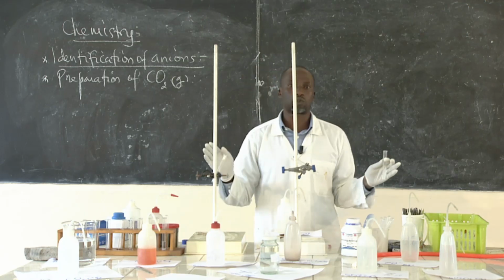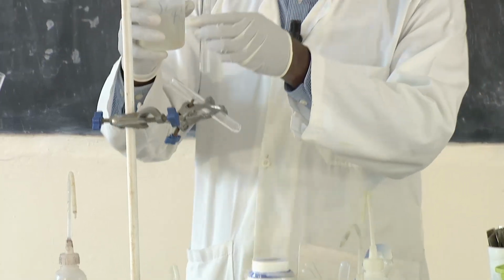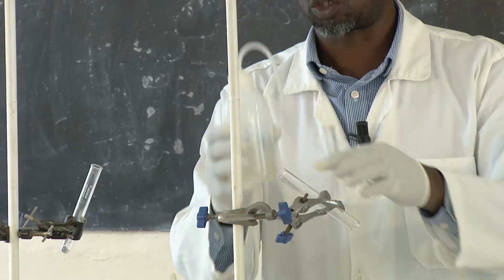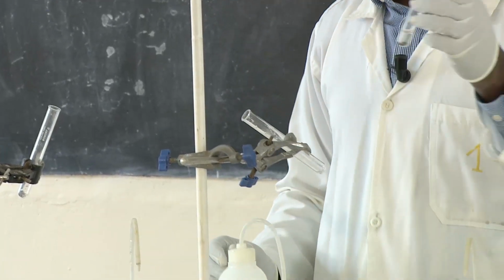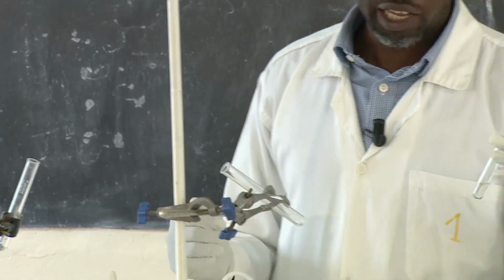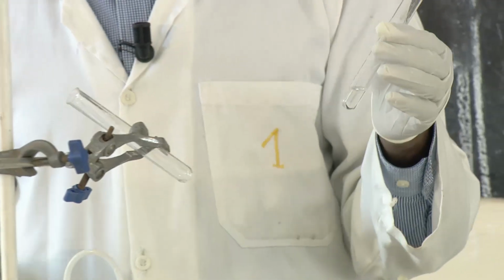So we just approximate, because we are just looking at the quality of the solution. This is about 3 cubic centimeters of the solution containing the sulfate.